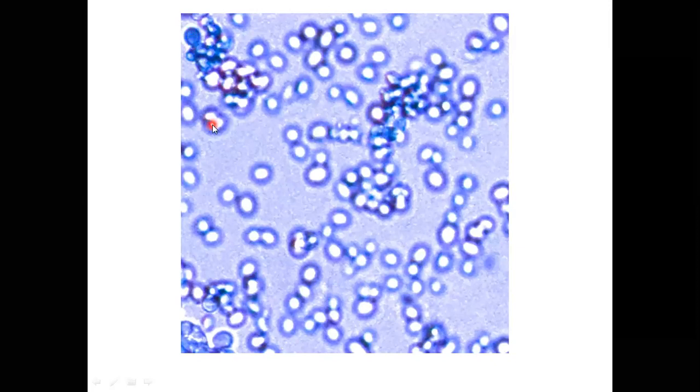But if you see a cell like this one, where my spotlight is, you can see this is a cell which look like what we know it in theory. This is a dividing cell. This is a budding cell. You can see they have not detached. In fact, they are at the last stage of cytokinesis. If you are to deal with mitosis, this is cytokinesis. And you can see even this one has just begun to bud. These are budding cells. Indeed, what we were looking for, students were only expected to draw the cells that are budding. Without that, no mark.